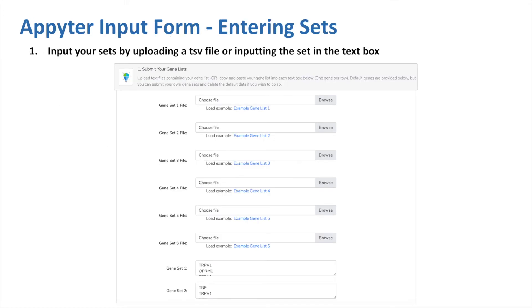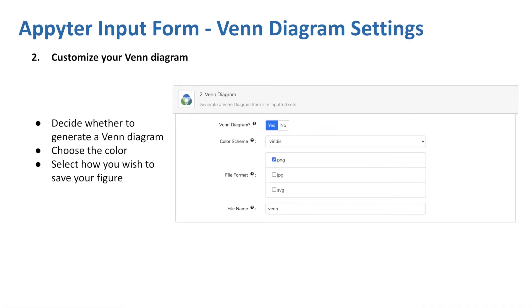To generate these visualizations and perform these analyses, the user must first input their gene or drug sets in the form of a .tsv file or enter their sets in the text boxes below. Users have a few options to customize their Venn diagram. The user must decide whether they want to produce a Venn diagram, and if they decide to do so, they have the option to choose the color scheme of the Venn diagram and how they wish to save their figure.